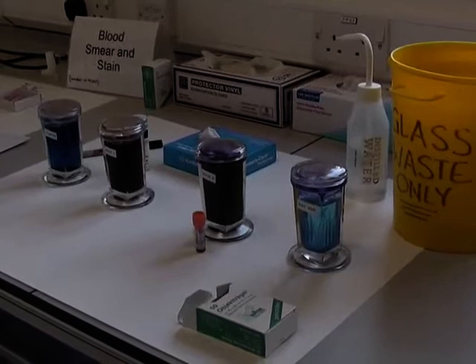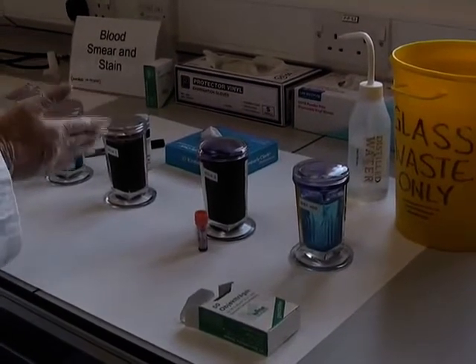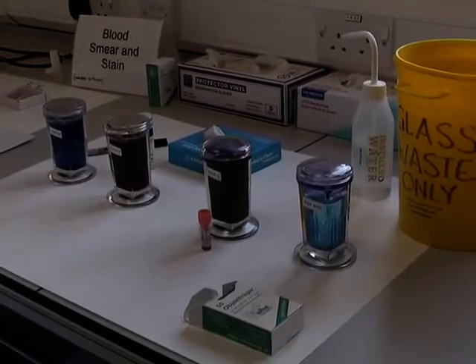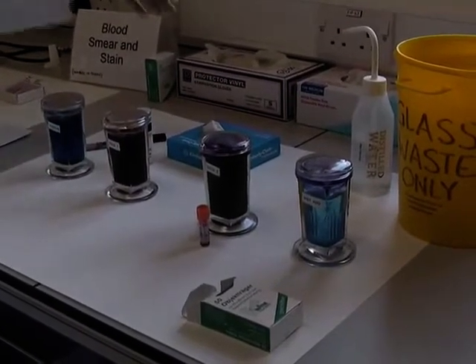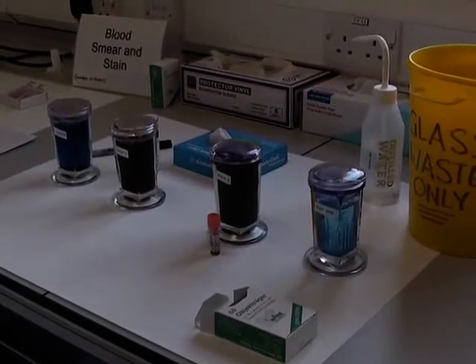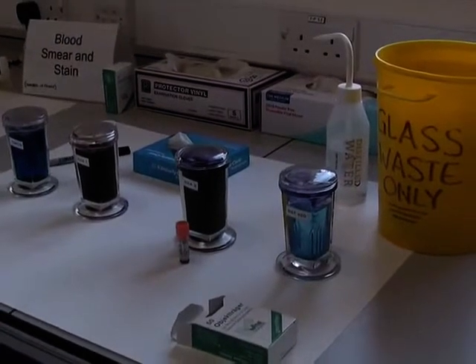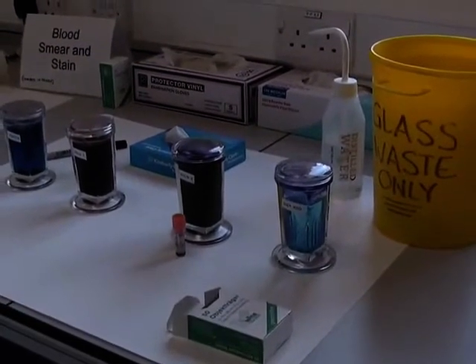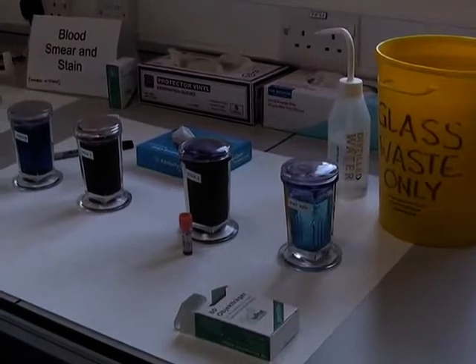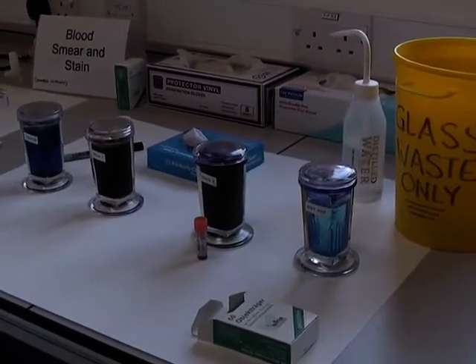The equipment that you will need: fixative solutions 1 and 2 and distilled water, tissues, a marker pen, glass capillary tubes, further distilled water if necessary, microscope slides, glass waste, and of course a blood sample in potassium EDTA.